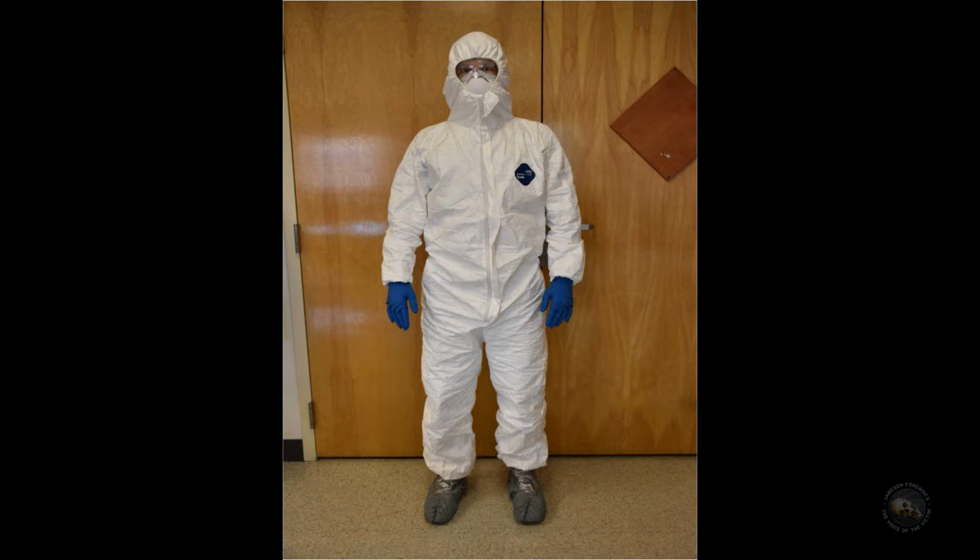So now your butt is at the crime scene. This is exactly what you should look like. You are double-gloved. You have duct tape on all of your seals. You are especially wearing a mask. And you have a hood on to keep your hairs out of the crime scene.